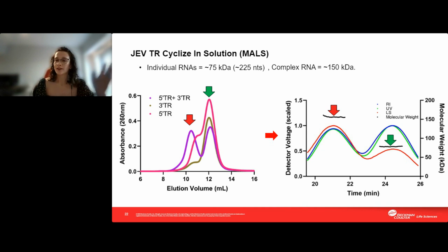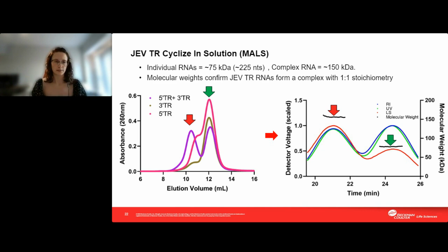We've tried a lot of things to purify away this dimer formation within the individual RNAs, and it just didn't happen. They always formed homodimers with themselves. And because of this, we couldn't be certain that the dimer complex we saw when we mixed the 2 of them together was a heterodimer of the 5' and 3' together, and not just somehow forcing the 5' to bind with itself. So the next study that we did turned to AUC.